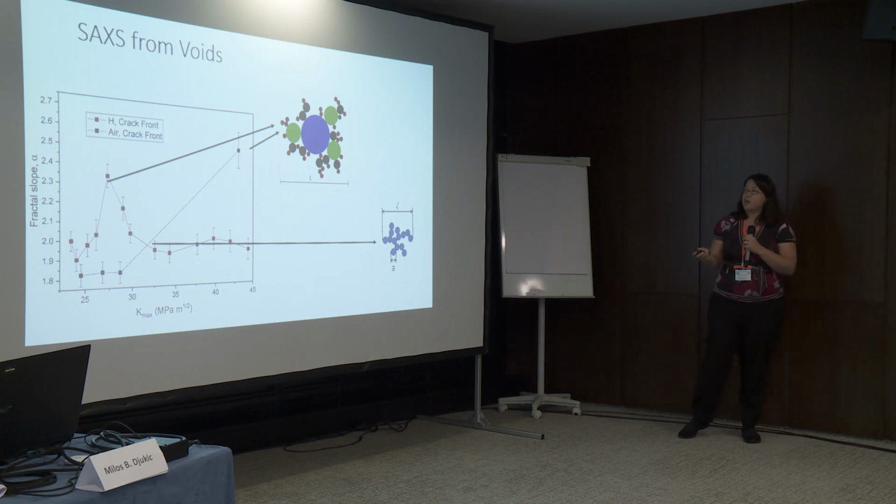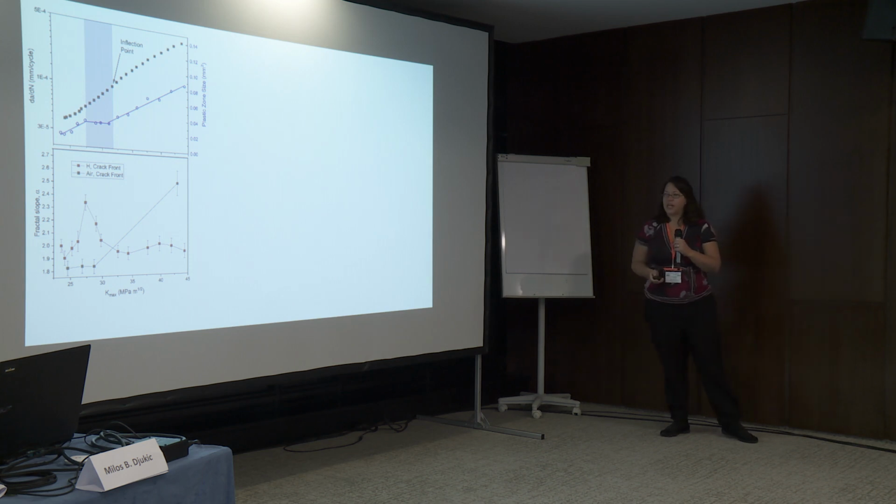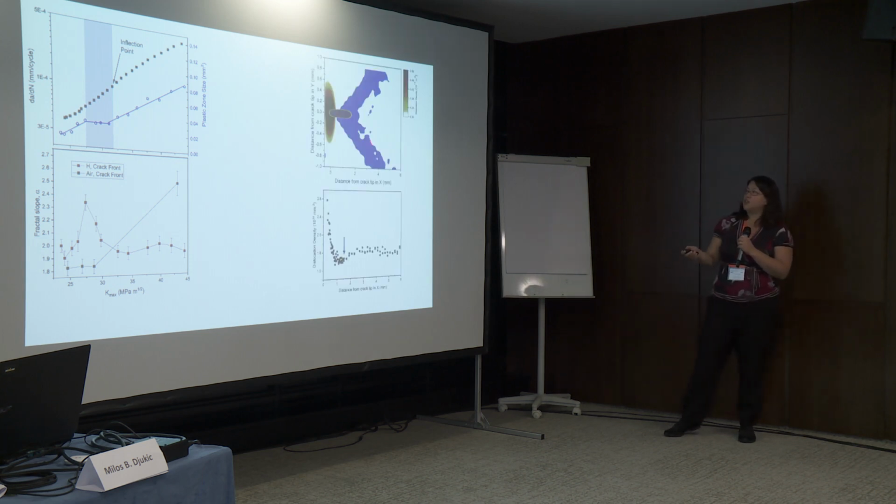Does this peak correspond to where we think it does? Yes, it does. This region where you have the plateau in the plastic zone size corresponds with this start peak, and then it decreases through the plateau region, and then enters again this baseline flatter area once we start growing the plastic zone size again. So if we're looking at the region of where this is happening, we're integrating over about 2 millimeters ahead of the crack tip.